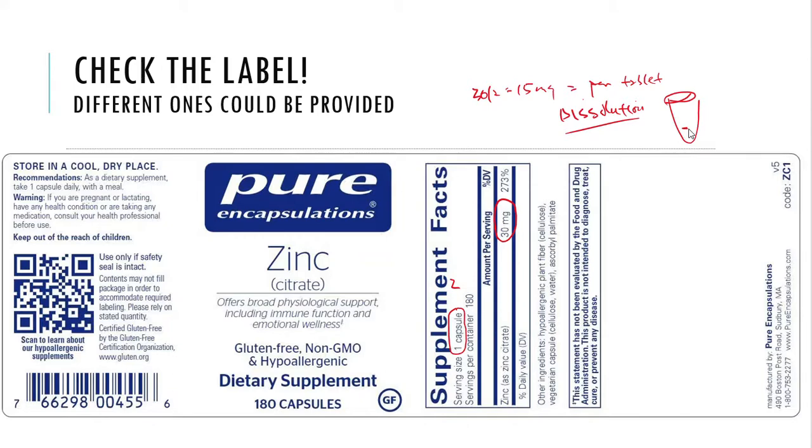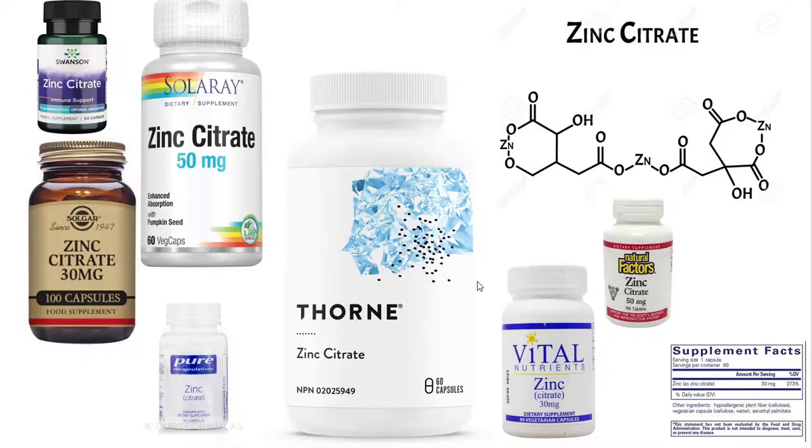All right, so that's something that you need to look for. Make sure that you write that down. We need to know the brand of the pill that you're using. We also need to know the milligram amount on the nutritional label, or the supplement facts is how they have called it here.